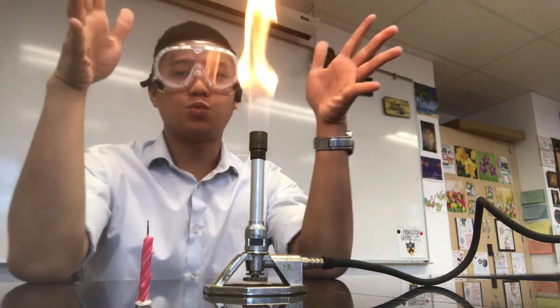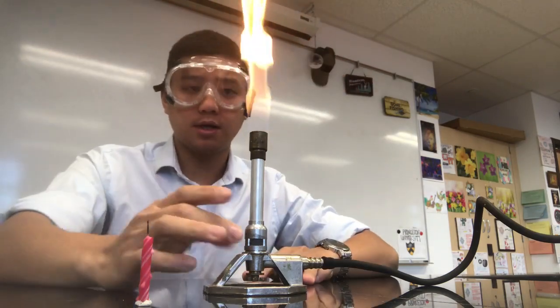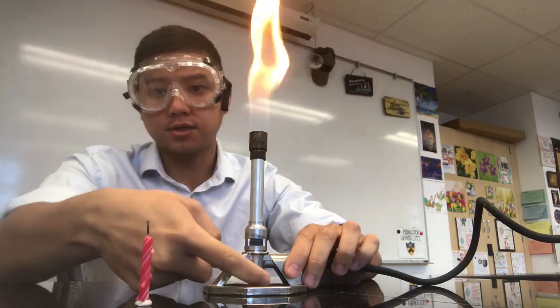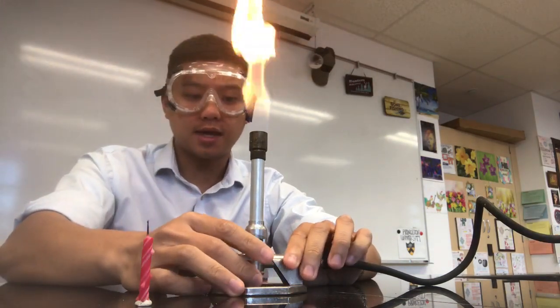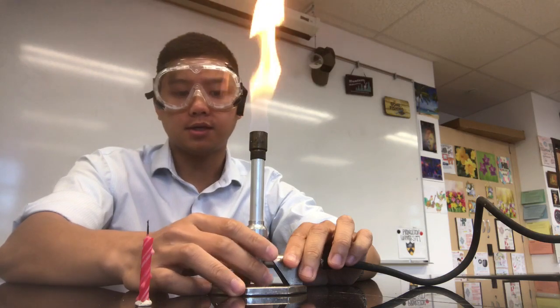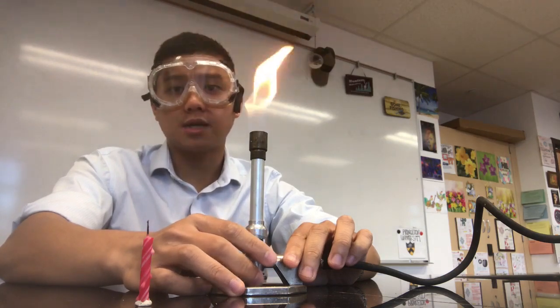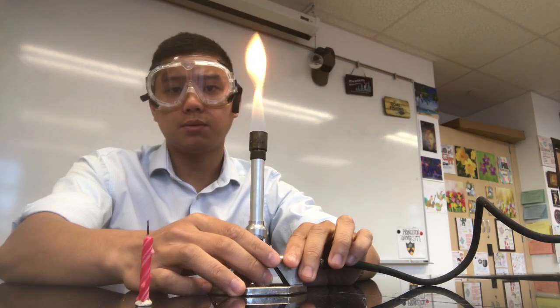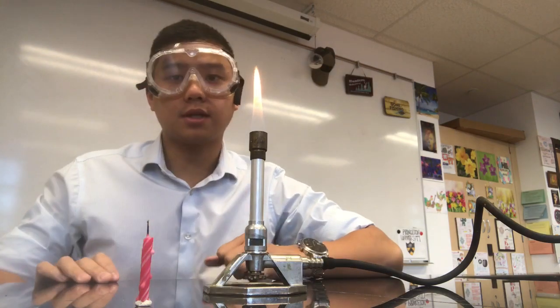Now right now, this flame is really big and it's really dangerous, okay? I want it to be maybe 3 to 4 inches high. So the way I do that is there's this little knob at the bottom here. That's the gas control knob. And I am just gonna turn it, and what that does is it controls how much gas is going in there. Again, I want it so that it's just a couple inches high, and I got a nice solid flame there, so that looks good, okay?